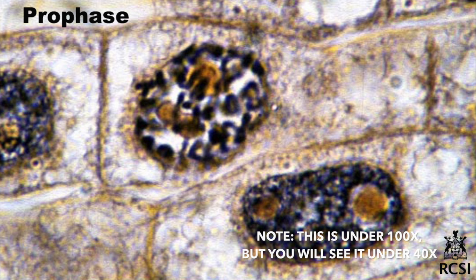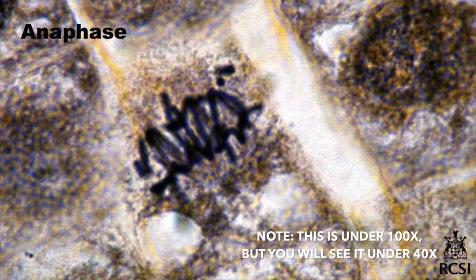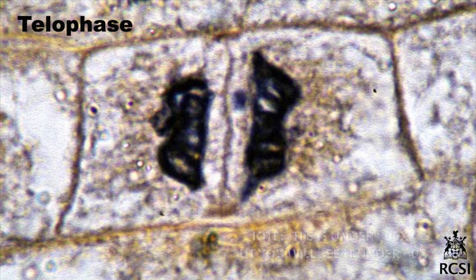In prophase, the nuclear membrane disappears. In metaphase, chromosomes are lined up on the metaphase plate. Anaphase is only occasionally seen, with chromosomes separated and moving towards opposite sides of the cell. In telophase, the nuclear membrane reappears, chromosomes become invisible again, and a new cell wall forms during cytokinesis.